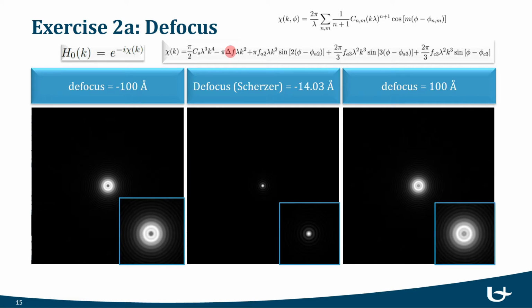In practice, aberration causes the wavefront to deviate from the spherical surface. This deviation can be represented as a phase error chi, a function of the spatial frequency in polar coordinates, which can be written as a series of expansions. Since we start all our simulations from the default setting values, all aberration coefficients have 0 values, but C3, which has a value of 1 micrometer.